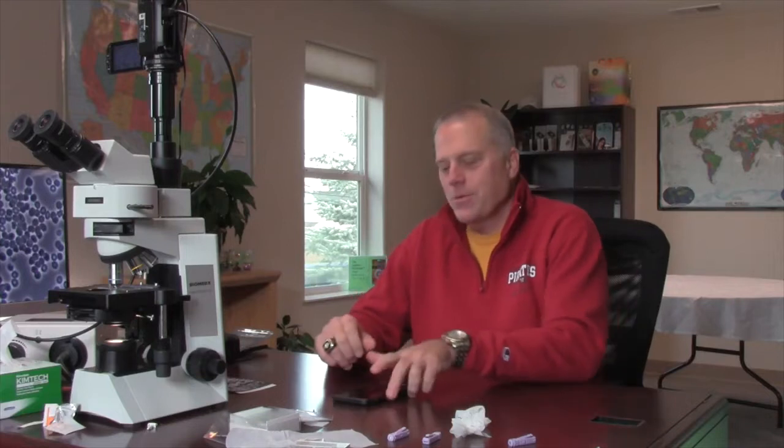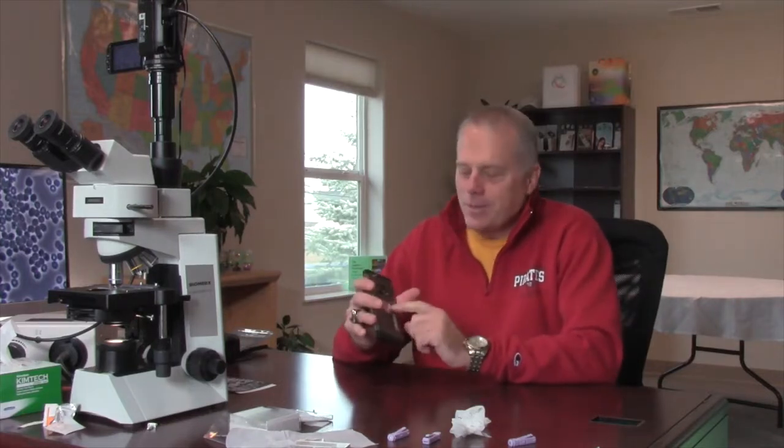Hi, this is Norm Johnson. I'm here at the Aulterra headquarters. We're doing a little testing with the neutralizer. I just got to look at my blood before, during, and after a phone call with and without the neutralizer, and it's pretty scary stuff. When you're able to witness this in person, it really makes an impact.